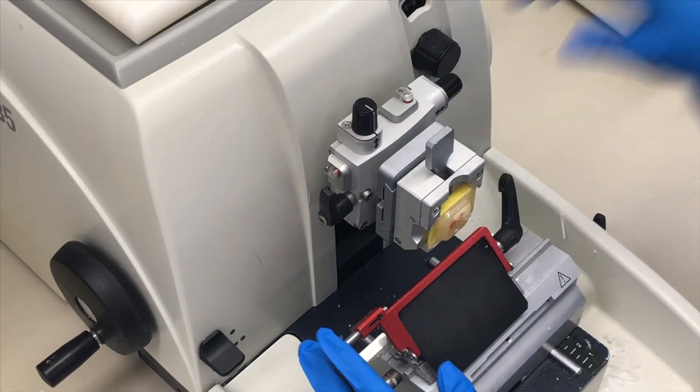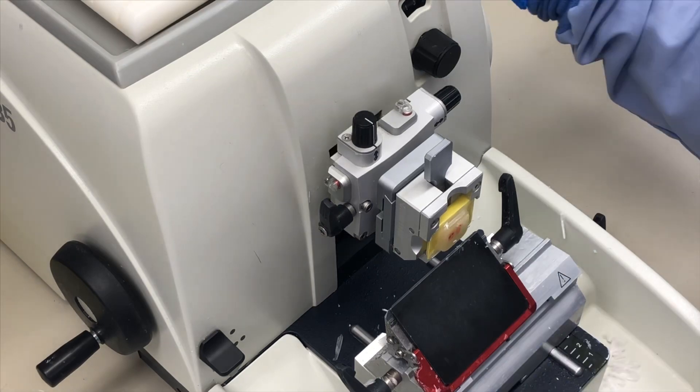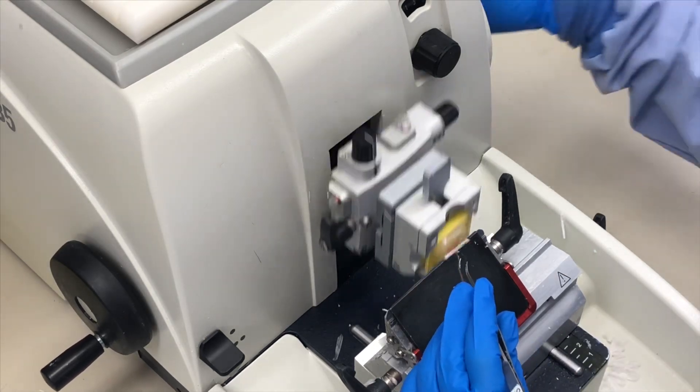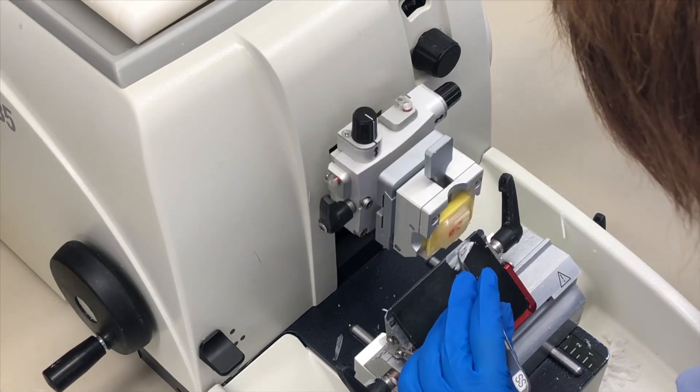Once the block is chilled, we put it into the chuck attached to the microtome. We use a sharp blade to cut sections at around three microns.